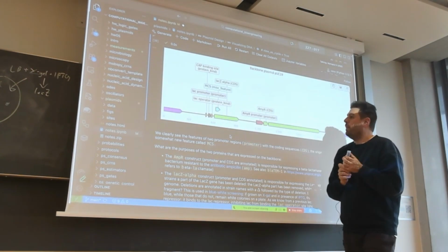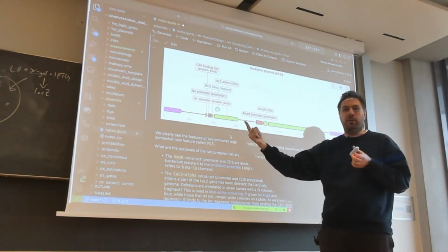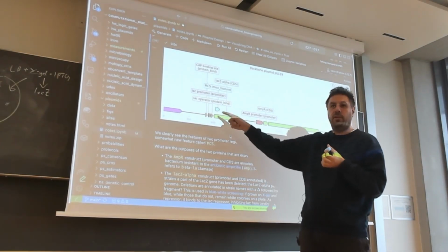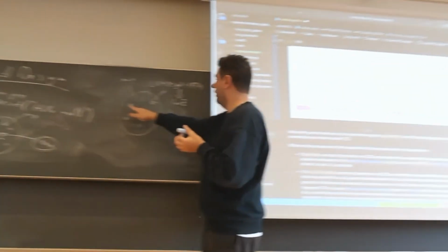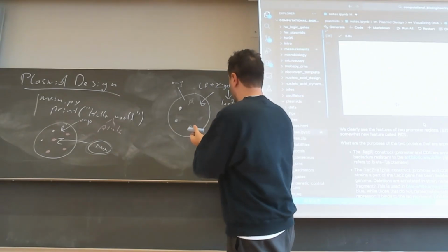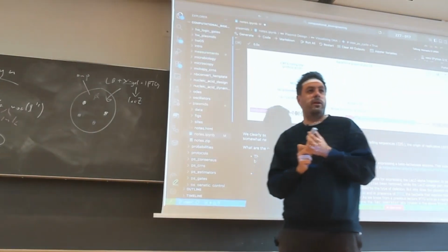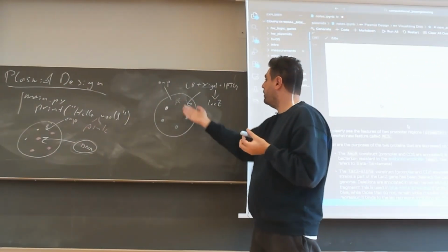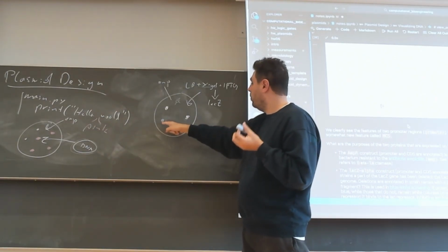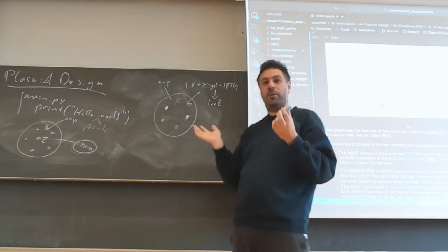Yeah? Okay, but this is very weird, right? Like, I mean, this is overlapping completely with this fragment here. But that's the point. Yeah? Because actually, if your insert works, you're totally destroying this blue thing. You will have a white colony, right? So in the end, you will have kind of three types of colonies after the insertion. You will have the colonies that don't have the plasmid. I mean, they're immediately killed by ampicillin. They don't grow. You will have the colonies where your cloning didn't work. They are blue. And you will have the colonies where it hopefully worked, and they're white.